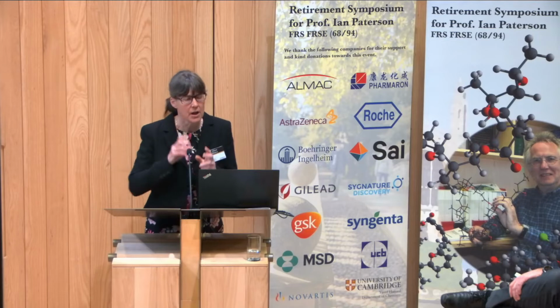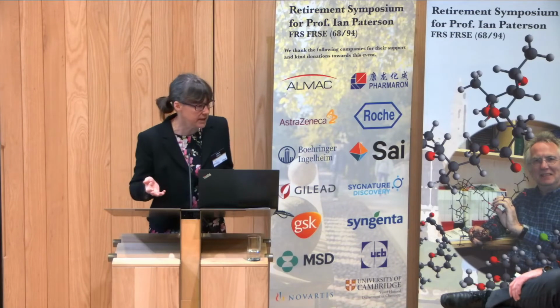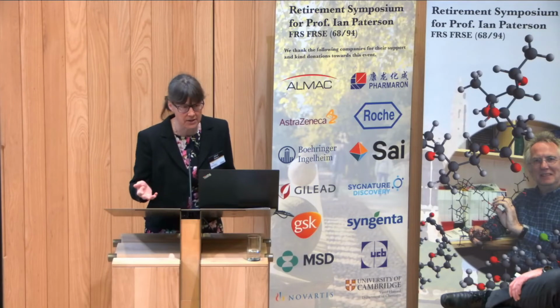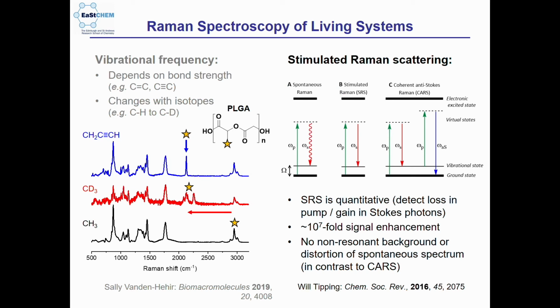Okay, and that coherent spectroscopy actually then increases your signal, and you get a 10 to the 7, 10 to the 8-fold enhancement in signal. And so suddenly we can start to do things because we need less time on each pixel. We can start to do things in a realistic time frame.